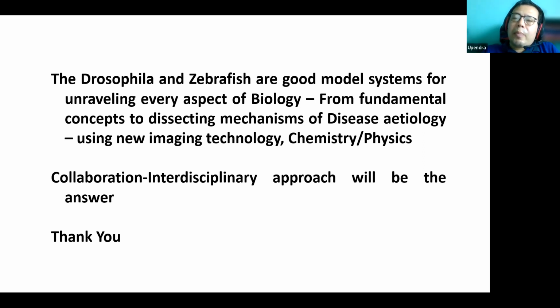So at the angstrom level, some of the proteins, if you look at their structure, have been solved by, of course, many different kinds of X-ray diffraction and all these things, but today the whole complex structure can be seen by using cryo-EM. But for that you need a technology.